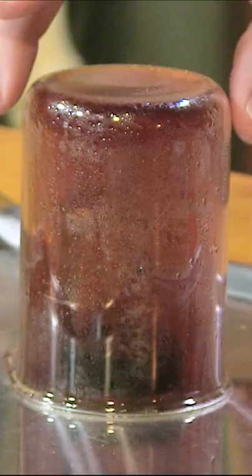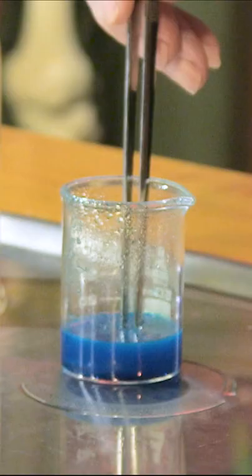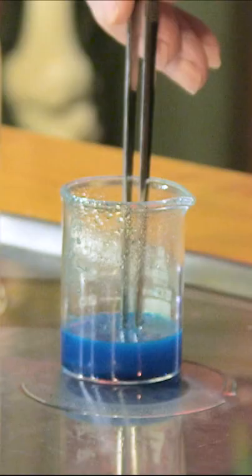If I would inhale enough of that, it would get into my lungs, dissolve in the liquid in my lungs, and recreate that nitric acid. We've got the studio ventilator on — it's taking all the gas out. If you look carefully now, you can see a pretty blue solution. Got copper nitrate solution in there.